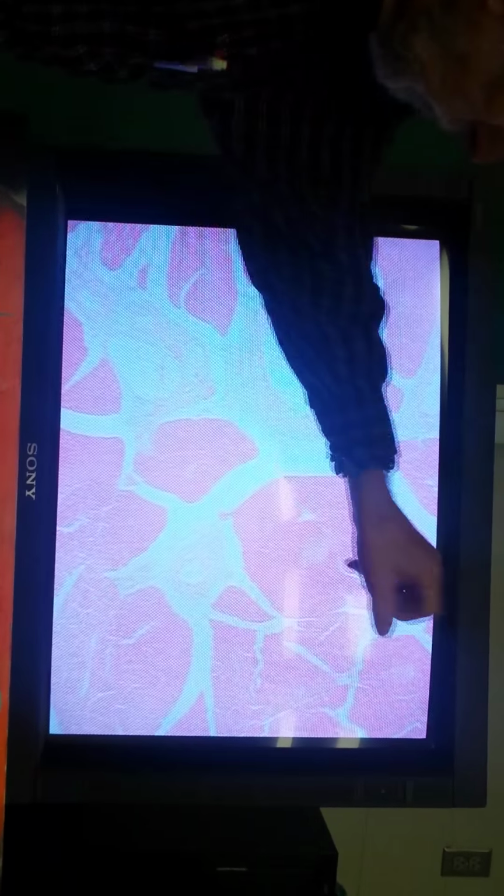That's one, okay. 2, 3, 4, 5. Okay, we've got 5. I think that was one right there. Let's go see. But maybe that one isn't. 4, that one isn't over there, okay. But this one is, okay. So that's an islet of Langerhans.